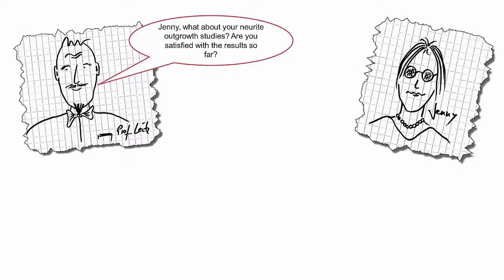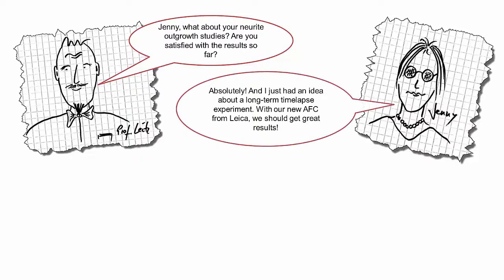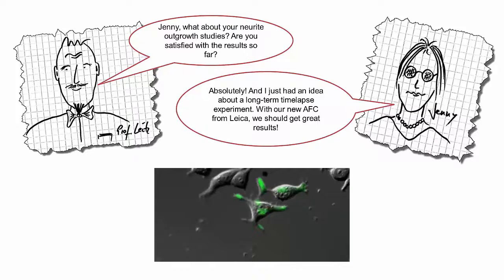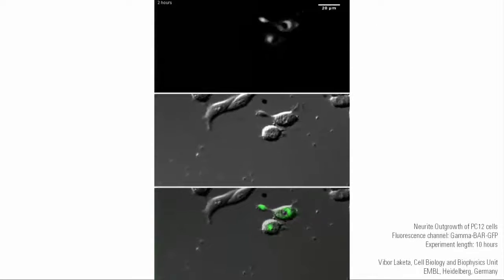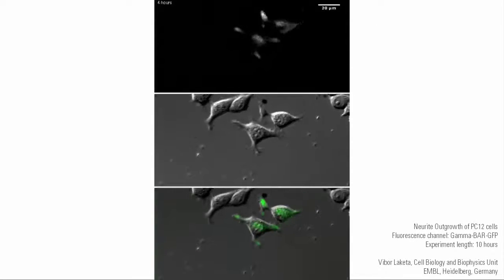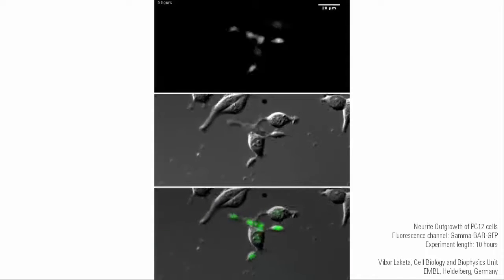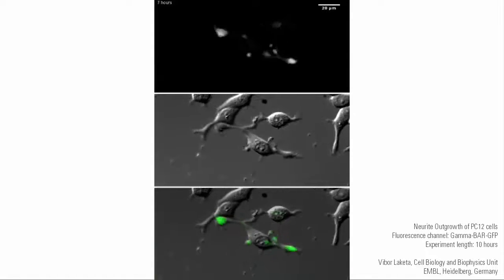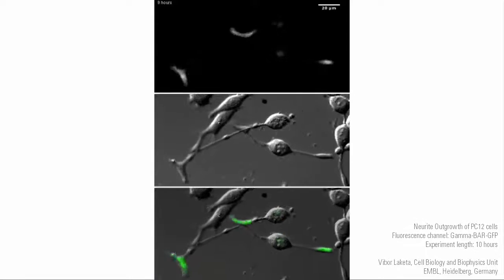Hey Jenny, what about your neurite outgrowth studies? Are you satisfied with the results so far? Absolutely. And I just had an idea about a long-term time-lapse experiment. With our new AFC from Leica, we should get great results. Thanks to adaptive focus control, long-term experiments like this 10-hour movie showing neural outgrowth of PC-12 cells can be imaged without losing focus due to environmental changes.